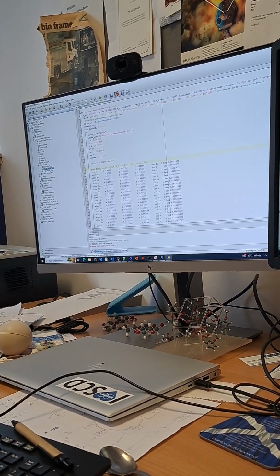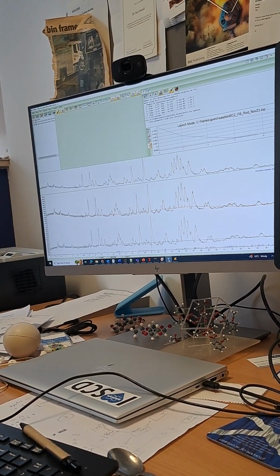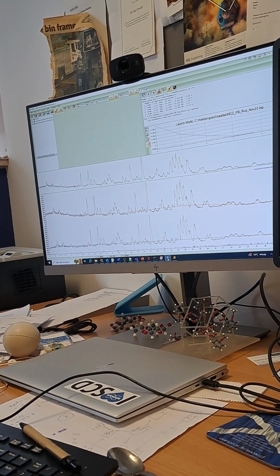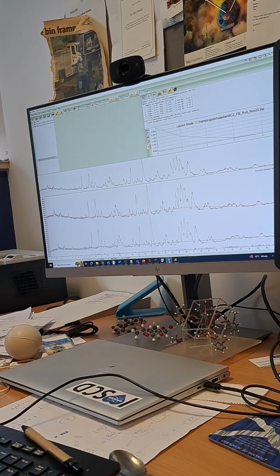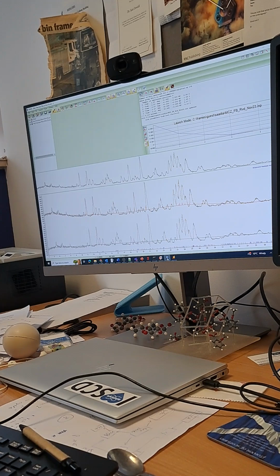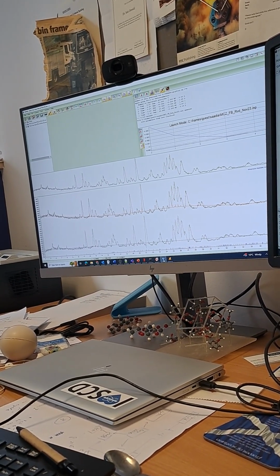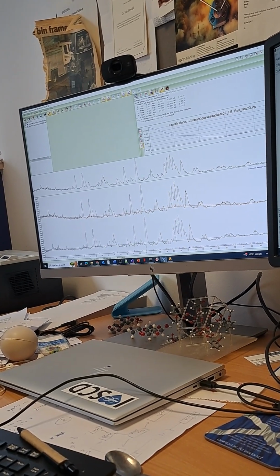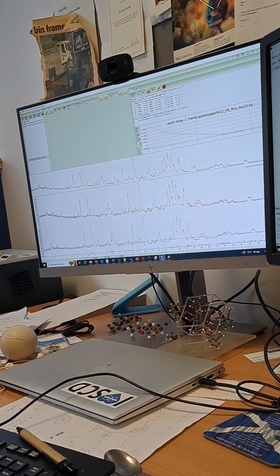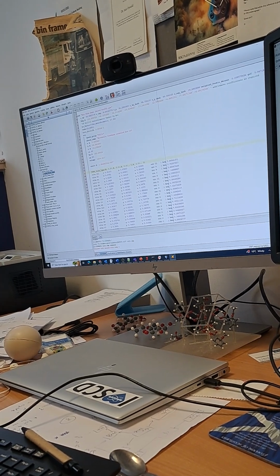What I'll do is open up the peaks. It allows it to do this, and hopefully it will move a little bit more. Because you're allowed to expand it like this, it can expand and shrink, and therefore it's able to move along the x-axis a little bit. If it expands, then kicks into a thing, it will do this. If it's not quite there yet, equally, we could just change numbers and change the unit cell so it moves along the x or this way or that way. That's one way of doing it. That gives us a better starting point. We might have to do that in a minute, but I'll try not to because it's a pain. Right, so we'll go and do that.